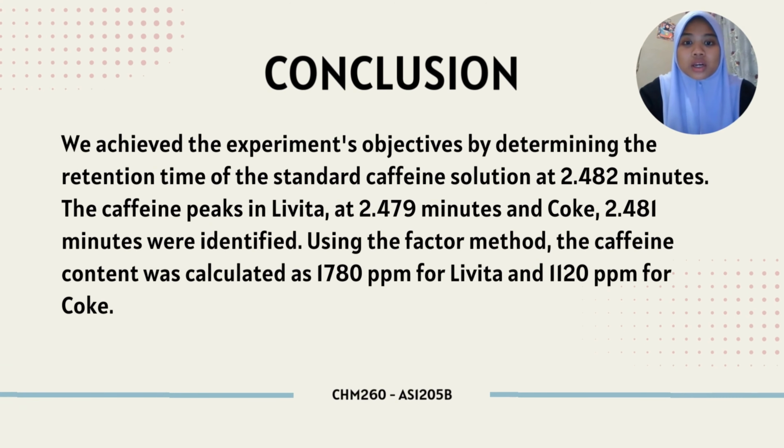So, in conclusion, we are able to achieve the experiment's objective by determining the retention time of the standard caffeine solution, which is 2.482 minutes. The caffeine peaks in Levita, at 2.479 minutes, and Coke, at 2.481 minutes, were identified. Using the response factor method, the caffeine content was calculated as 1780 ppm for Levita and 1120 ppm for Coke.